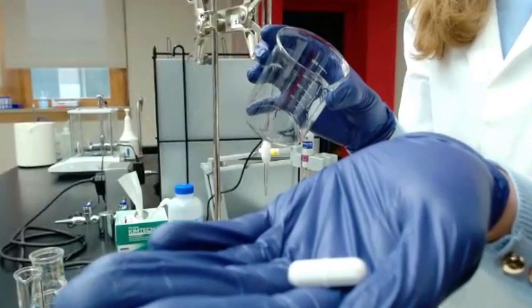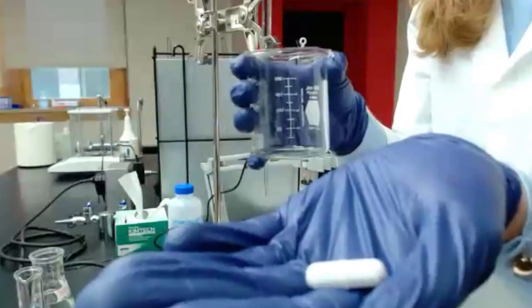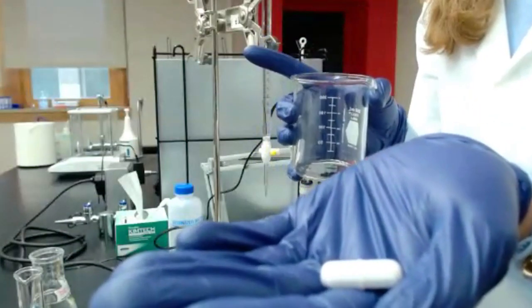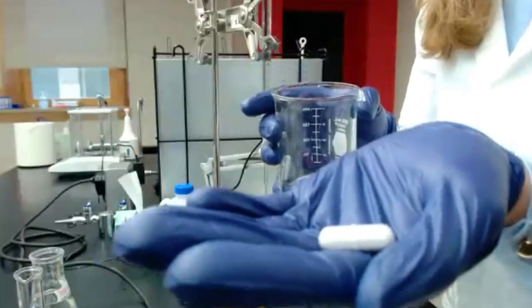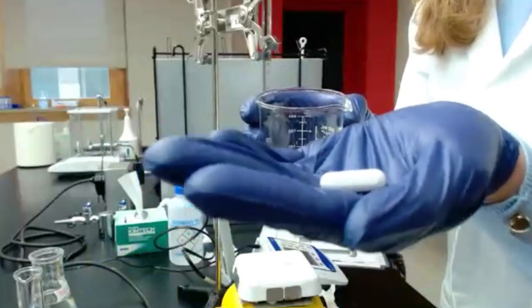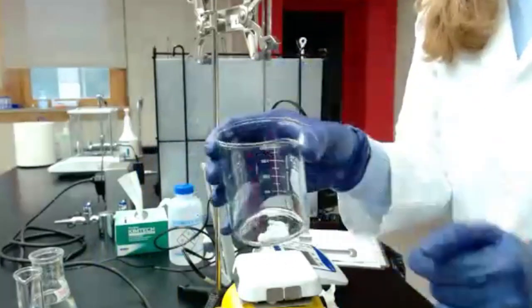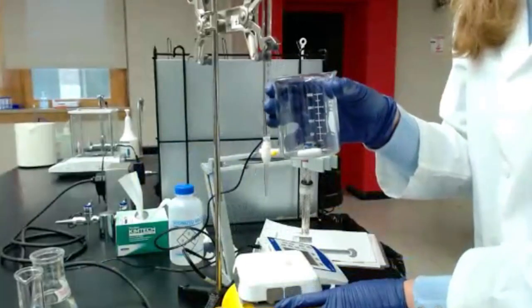If you don't have a stir plate, you're going to have to do it by yourself. It can be challenging because you will have to do 3 things at the same time. So it's probably worth investing in a stir bar and a stir plate. You have a lot of different sizes of stir plate.